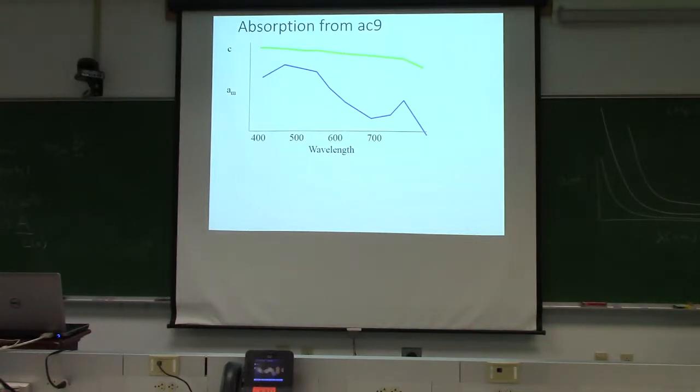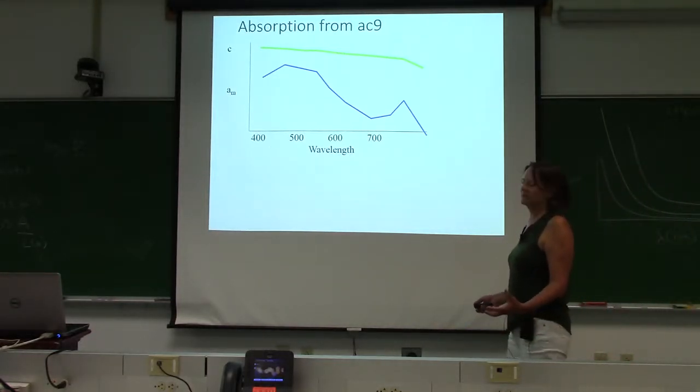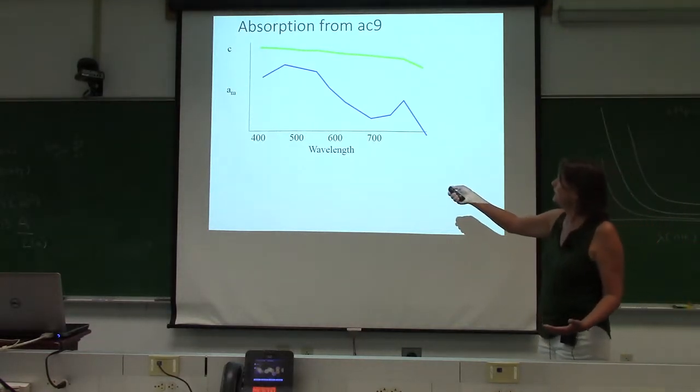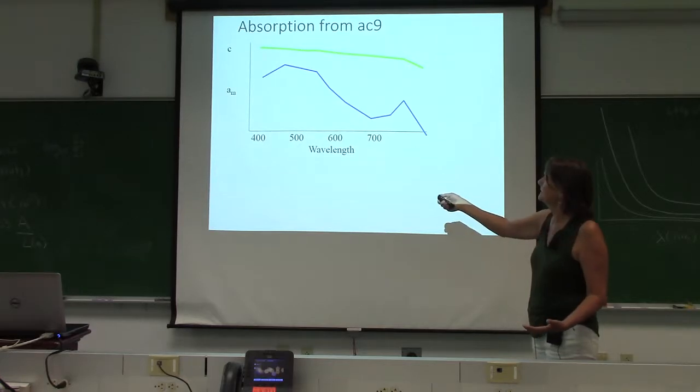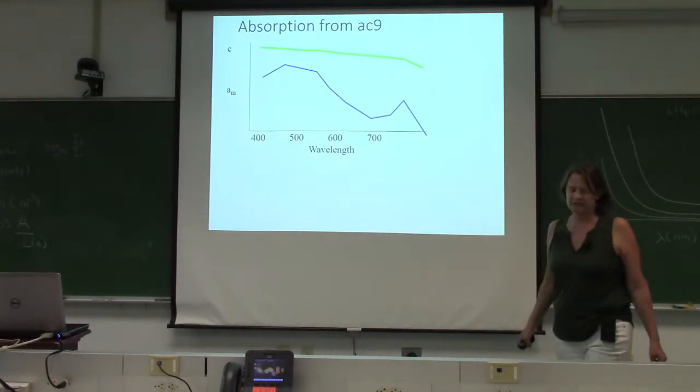Okay, so again, I show you an AC9 because it's just not as pretty. It feels clunkier, and so you tend to notice errors, I think, more. Here's the beam attenuation as a function of wavelength. Here's the absorption as a function of wavelength, and what do you notice about the absorption?